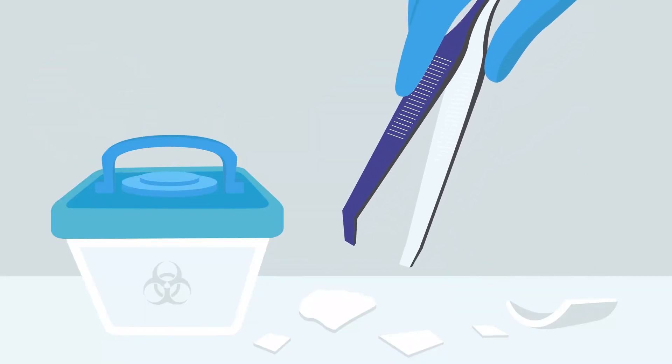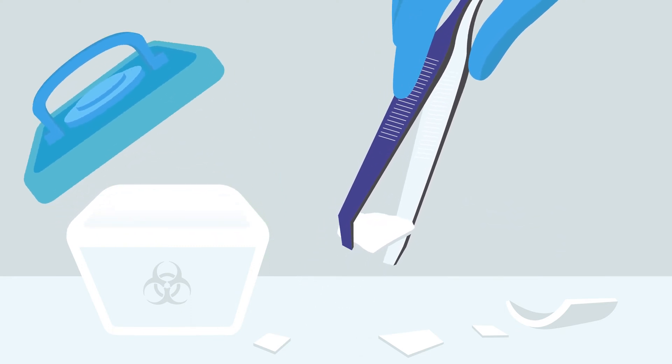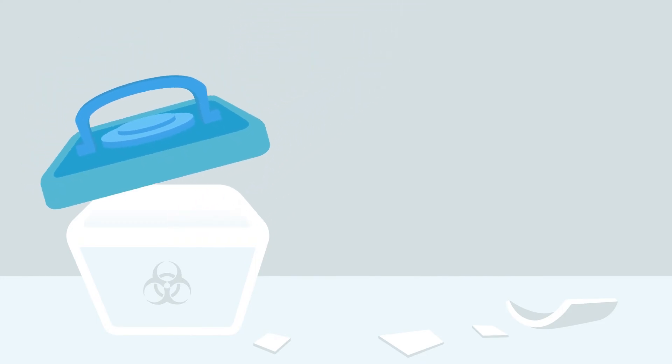Use tweezers to remove broken glass. Please note, broken glass should be disposed of in a puncture-proof container and in accordance with local regulation to ensure safety.